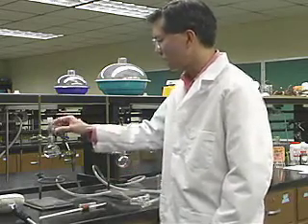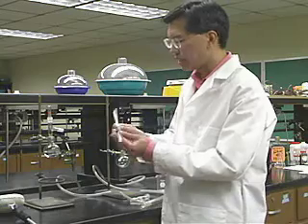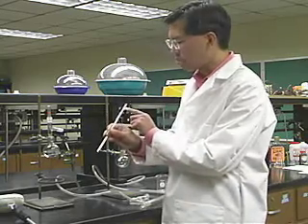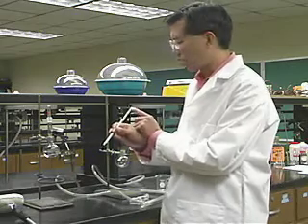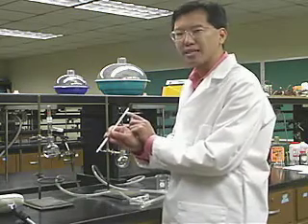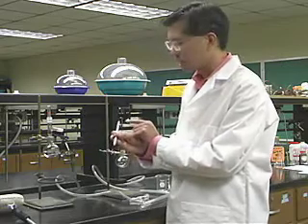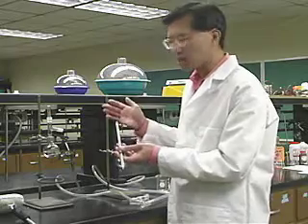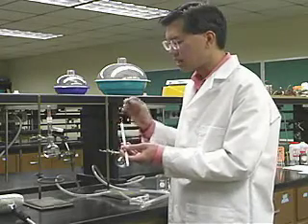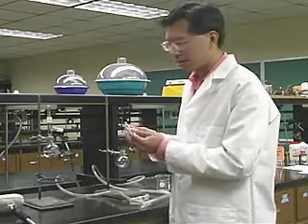We have an adapter, a thermometer adapter, and this is a thermometer. You have to make sure that the thermometer goes up to at least as high as your liquid boils. This one goes up to 110°C. Ethanol boils at 78°C, so that's going to be fine. But if we were distilling something that boiled above 110°C, you'd have to get a higher-range thermometer — otherwise you run the risk of breaking the thermometer, and breaking a mercury thermometer that way is a bad idea.